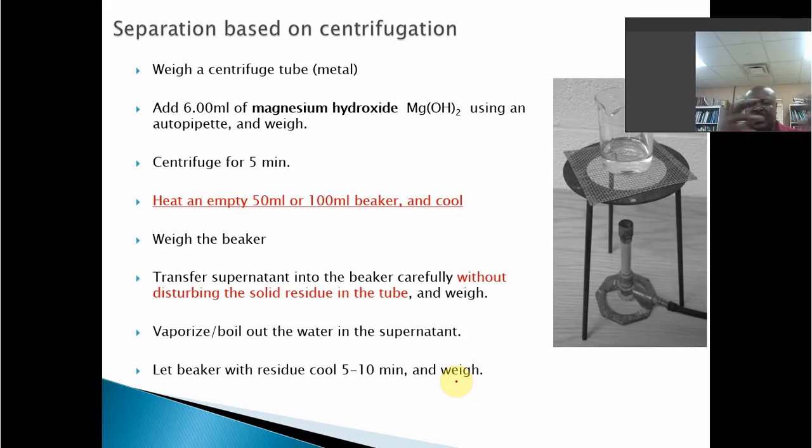Centrifuge. I indicated earlier the metal tube that you're going to rotate, you have to pull it up from the centrifuge. And you'll add six milliliters of magnesium hydroxide. Magnesium hydroxide, Mg(OH)2, is sort of insoluble. So if you look at it, it'll be white and chalky. So you want to mix it up before you pull out the six milliliters. So you mix it up. Then with the auto-pipet, you're good at auto-pipeting now, auto-pipet into the metal tube. And then centrifuge. You want to make sure that when you're centrifuging, the centrifuge is balanced. So there's a tube here that should be a tube opposite. Otherwise, then it doesn't work very well. It's unbalanced. So you have opposite masses that are about the same in all of them. Centrifuge for five minutes.